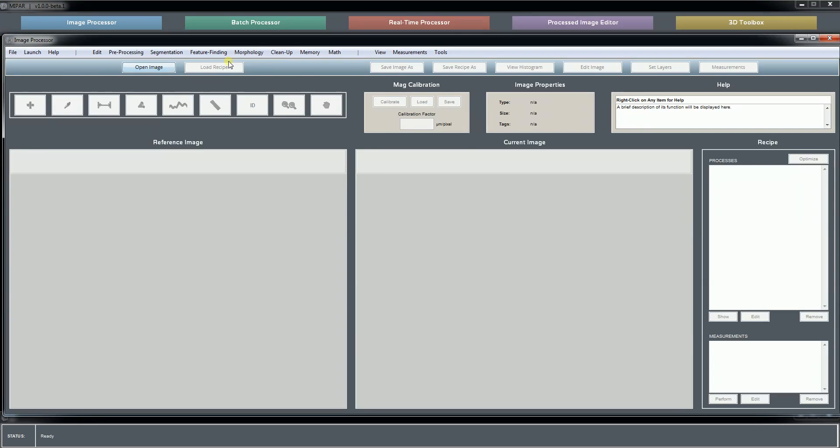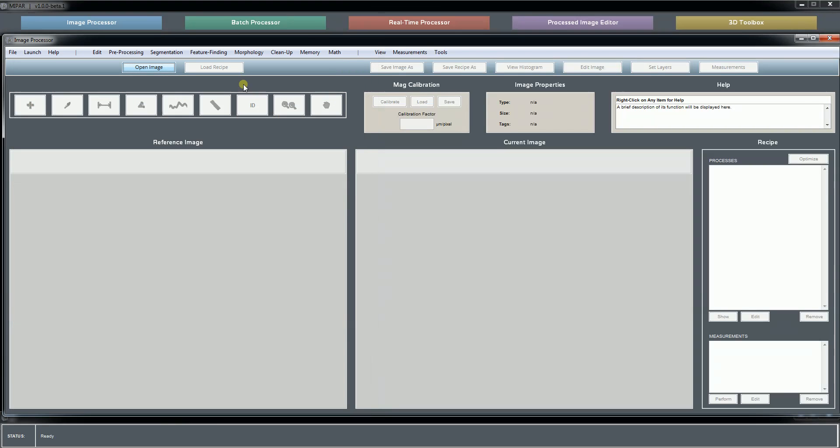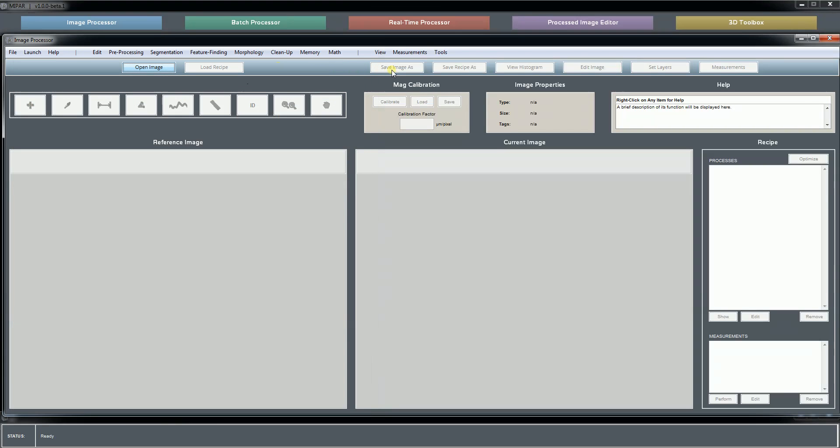Here's your shortcut bar. This gives you access to commonly used actions like opening an image, loading a recipe, saving an image, saving a recipe, making manual edits, and setting layers. We'll talk about those in one of the other tutorials.